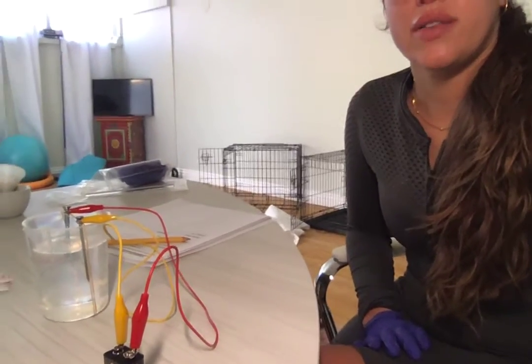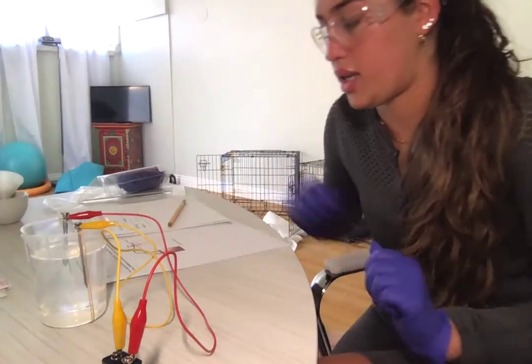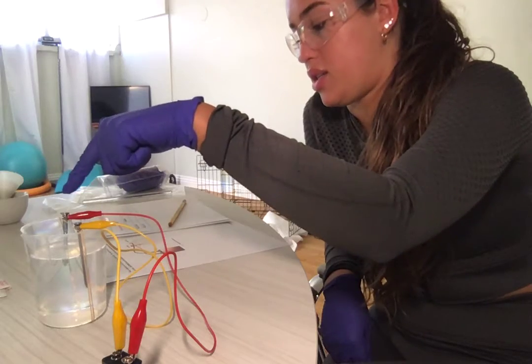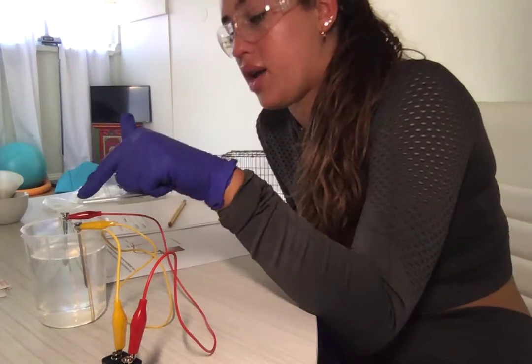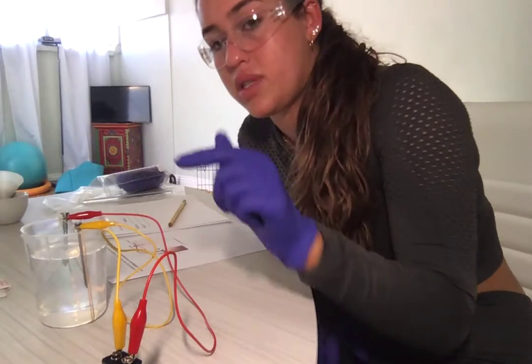I've let this sit for two minutes now. I connected the iron nail to the positively charged and the steel screw to the negatively charged. There are no bubbles coming off of the iron nail, and there are a lot of bubbles coming off of the steel screw.